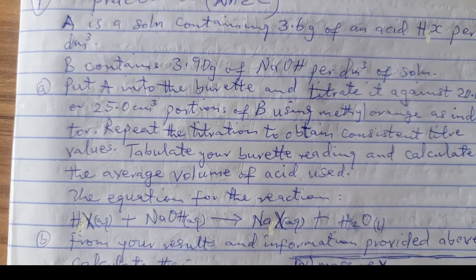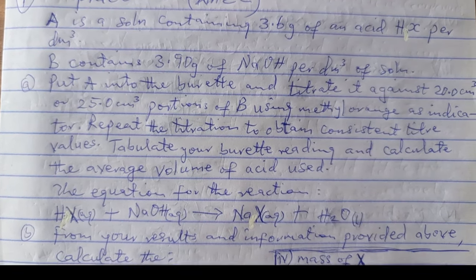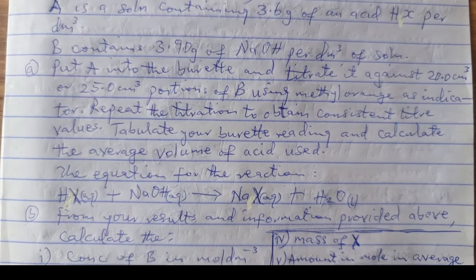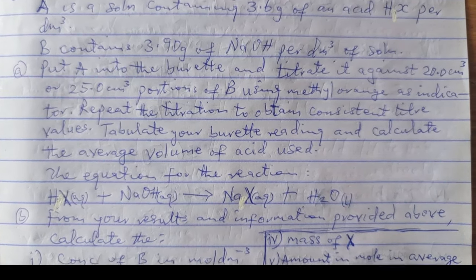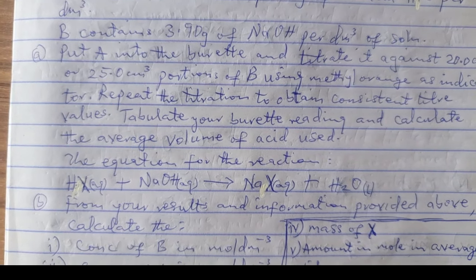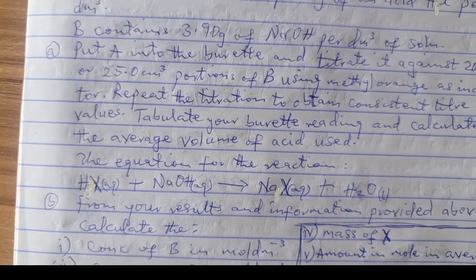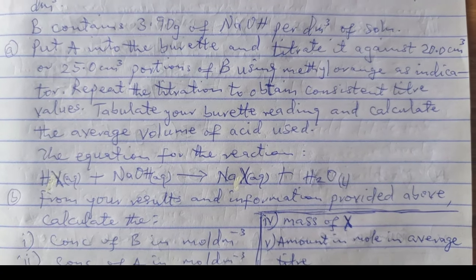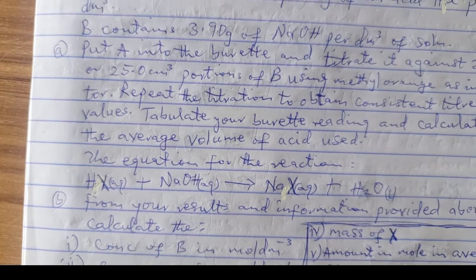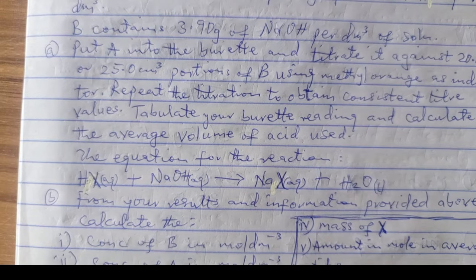Put A into the burette and titrate it against 20 cm cube or 25 cm cube portion of B using methyl orange as indicator. Repeat the titration to obtain consistent titer values. Tabulate your burette reading and calculate the average volume of acid used.